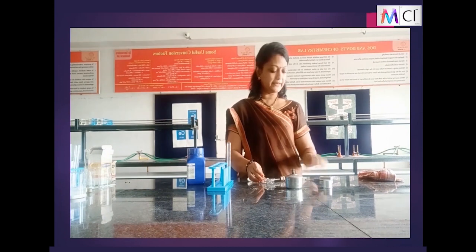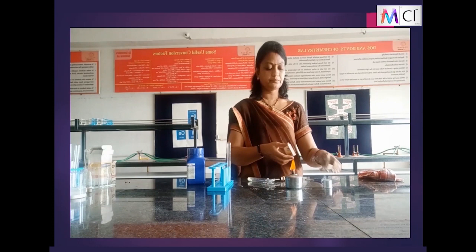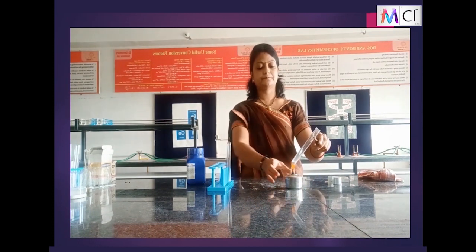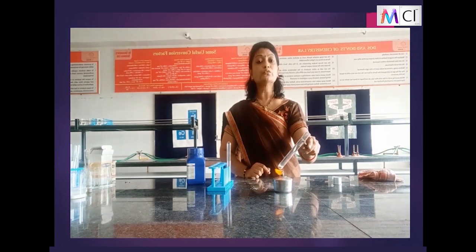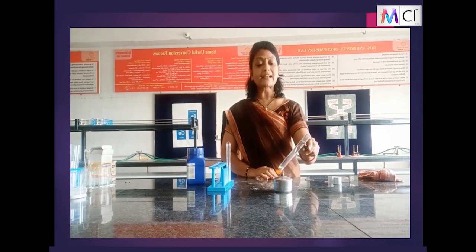Now we will go for heating. For that I will just start the spirit lamp and we will heat it. When you are heating, children, always be careful that the test tube should be away from your body. See the way I have the test tube in my hand. It's in a slanting position and the mouth of the test tube is away from my face, isn't it? It's very important to take precautions when you are heating it. See, a crackling sound has started.